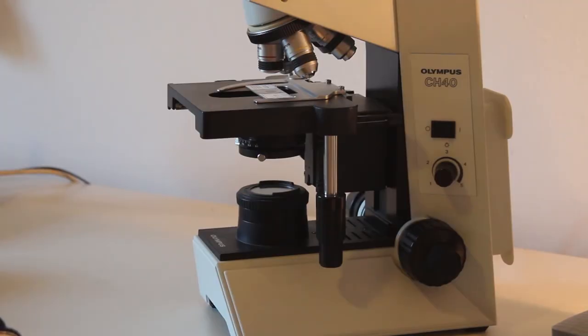Hello and welcome. In this short instructional video I'd like to show you how to properly use the compound light microscope.